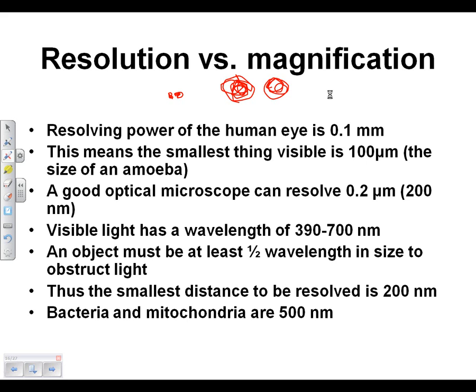See if you can see the amoeba on the microscope. The confounding problem there is that there's very little contrast between an amoeba and the surrounding slide and water. What you're trying to do is find a clear thing or an almost clear thing in a whole bunch of clear things. So it's not so much necessarily a matter of size as contrast. But give it a try. You might be able to see it.